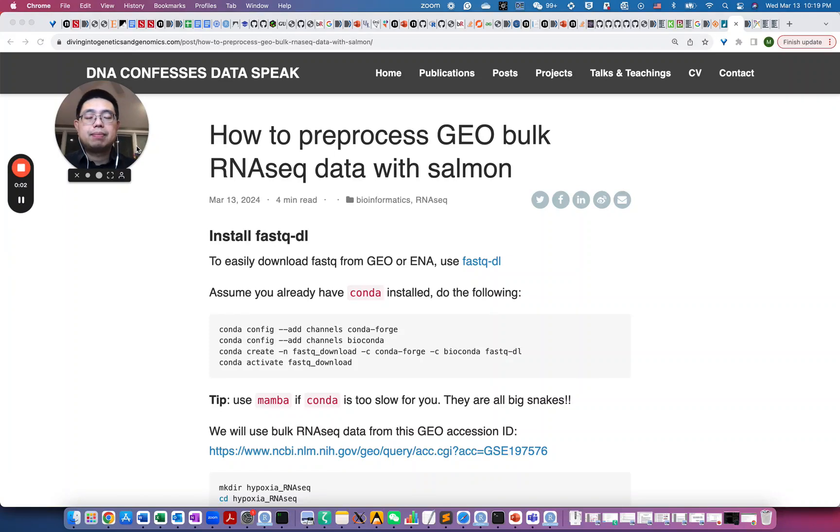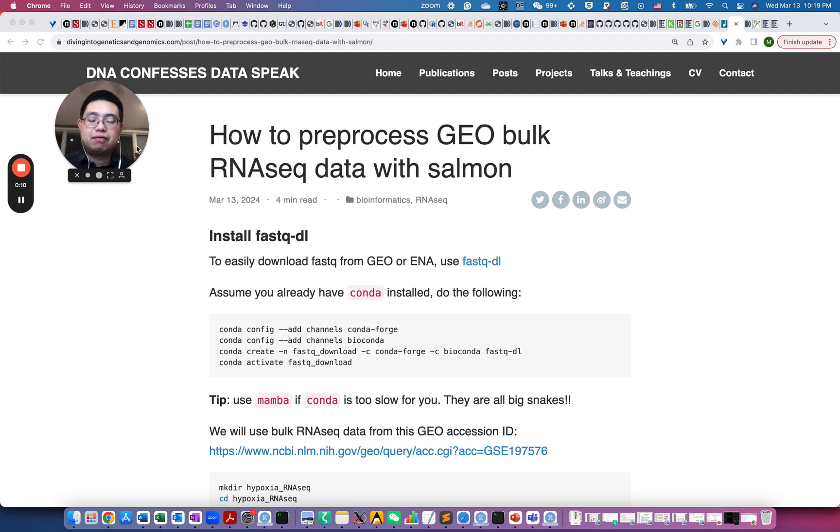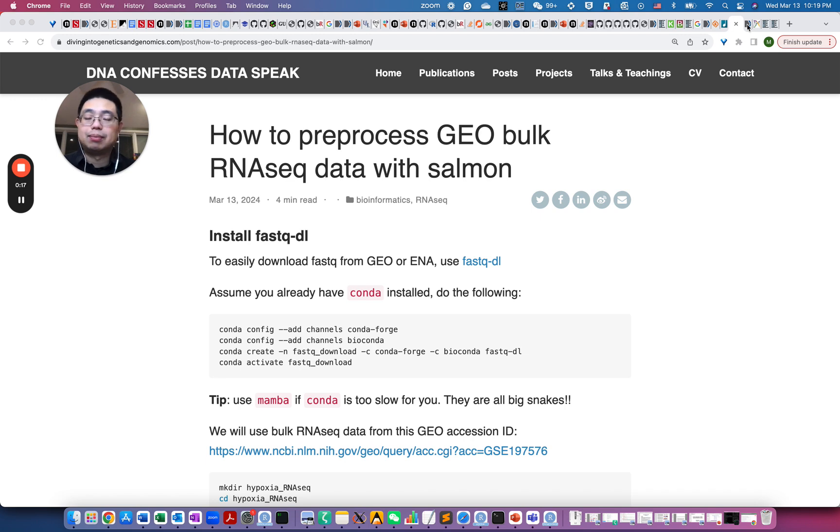Hello, this is Tommy. Welcome back to Chatomics. So in today's video, I'm going to show you how to use Salmon to pre-process bulk RNA sequencing data from GEO. So first, let's take a look at the example datasets we're going to use for this demo.